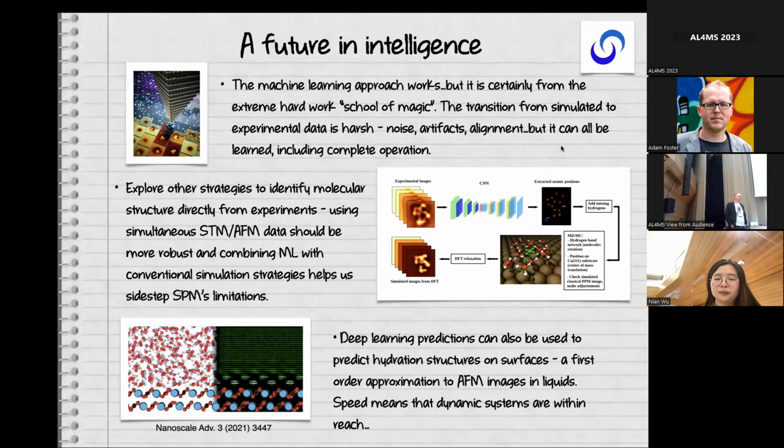Question from Gergely Juhas: can you include atomistic models into the reinforcement learning to control on new surfaces? This is a very good question, actually. One thing we are trying now, touching back to my first question, is that we're a bit skeptical that the agent will just be able to handle everything without having a clue. So we're now working on neural net potentials for the whole manipulation process. For a given surface, a given molecule, and a given tip, you could learn the interactions, and then we can try and predict paths.